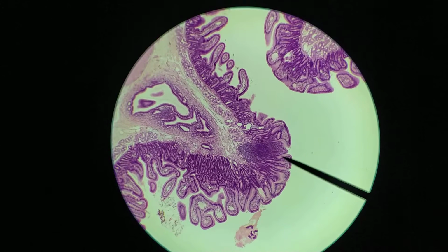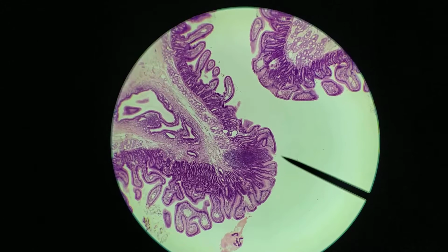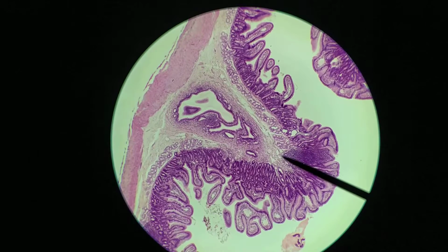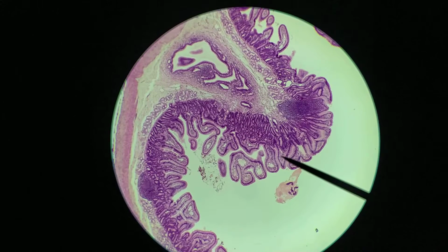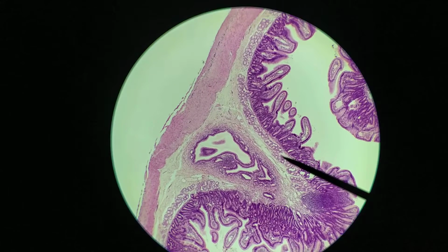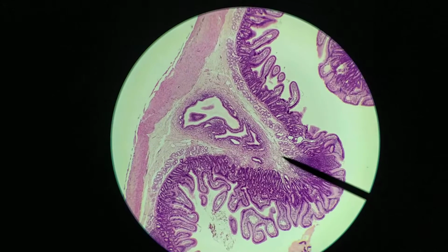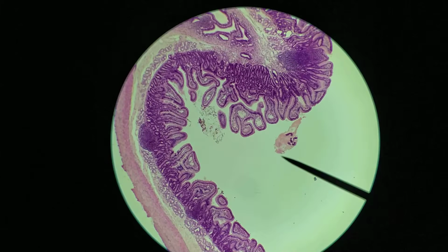Okay, so in the stomach this would have been called a ruga. It would have been a transitional sort of structure, but in the small intestine it's actually a permanent structure. This submucosal fold into the interior is called a valve of Kerckring, and so this is a permanent structure. It actually serves to increase the surface area for absorption. So this valve of Kerckring is there to increase the surface area by about 3 times. So there's an increase in surface area. Without this, you would have a lot less surface area, basically, about 3 times less.